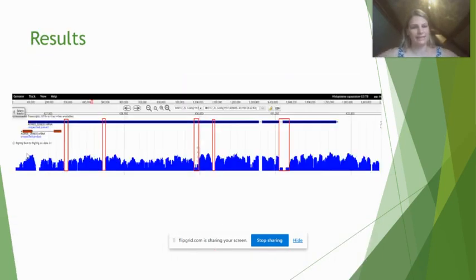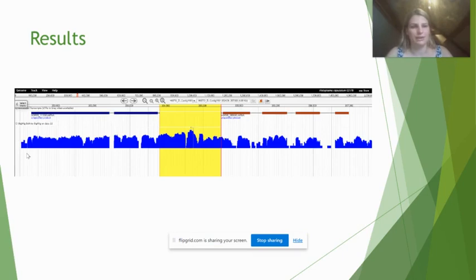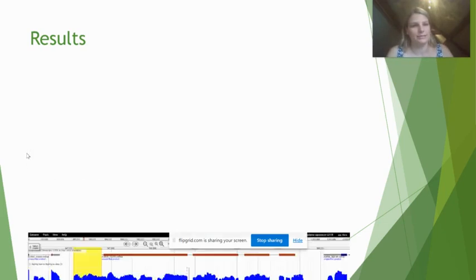The results, as you can see here, this is the coverage plot. You can see the introns don't align to where the coverage plot shows, which shows that the gene model might not be as updated and may need to be changed. As you can see here as well, these two genes seem a lot closer together, or they may even be one whole gene together. But yeah, this is an issue that needs to be corrected.